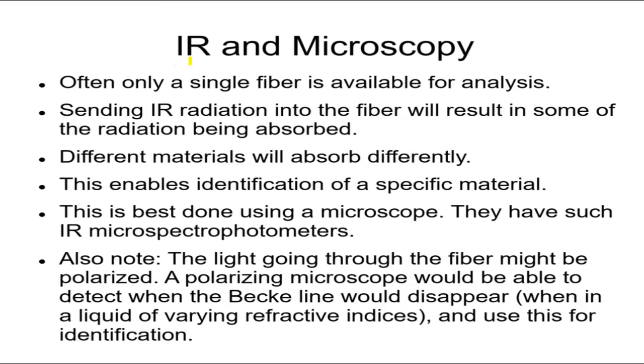But we want to use infrared. When we want to see what absorbs in the infrared, this gives very, very specific information as to exactly what compound, what chemical was used to dye this fiber. It will tell you exactly. Now, the other one will tell you where it absorbs. And you have several different chemicals that absorb in the same place or near the same place.